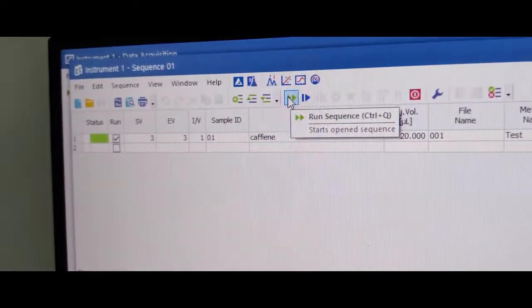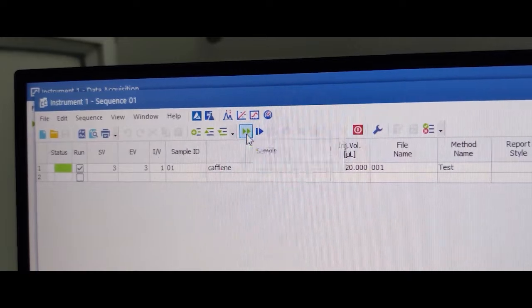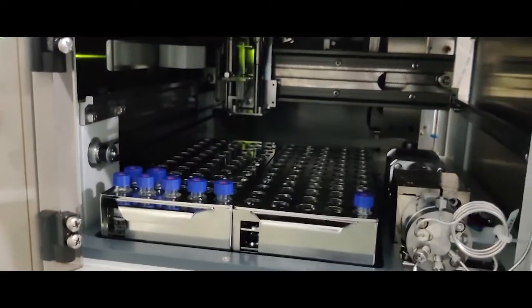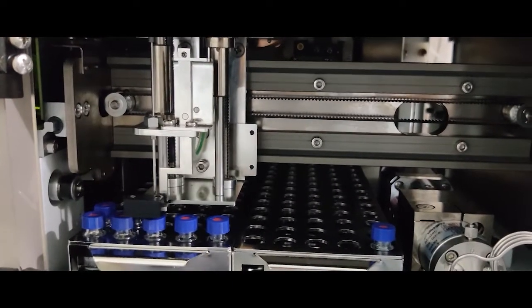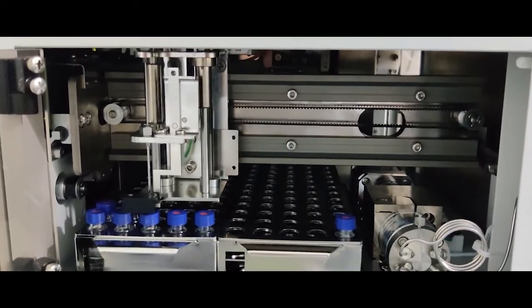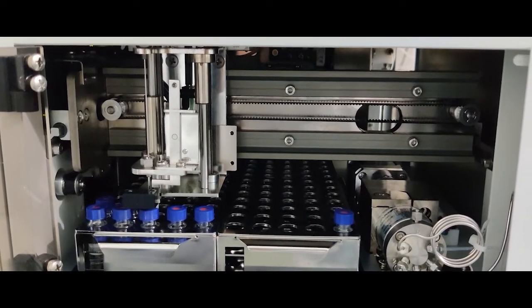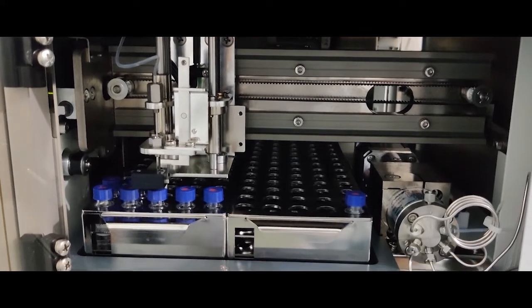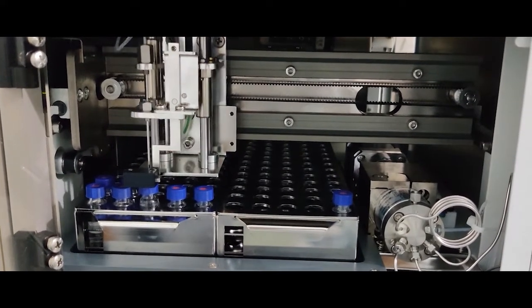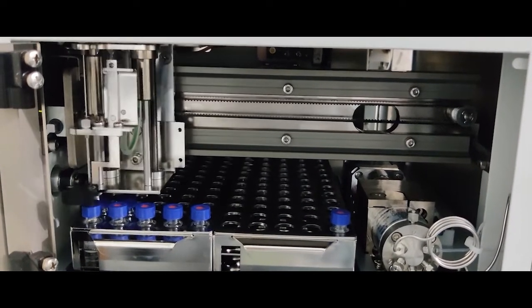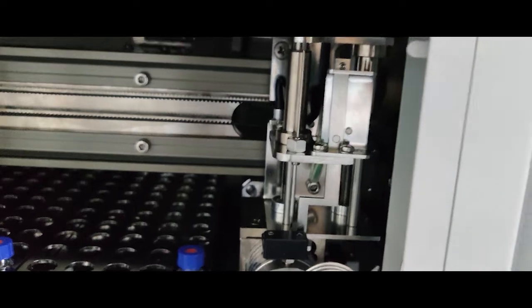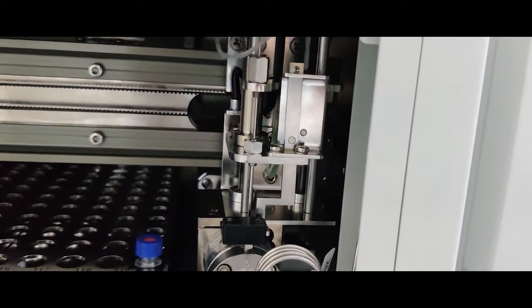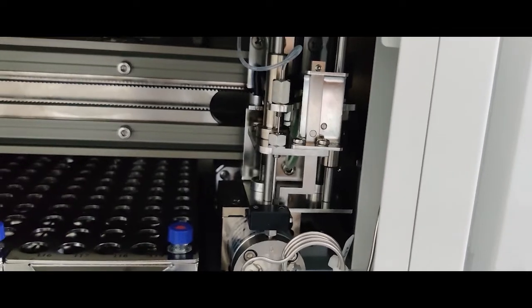So click the run sequence icon. Autosampler automatically takes the sample, then injects the sample. The run will start.